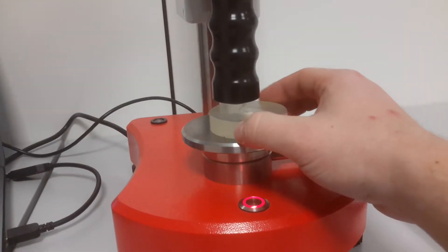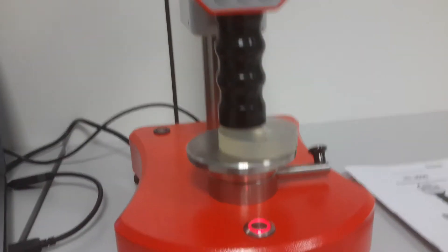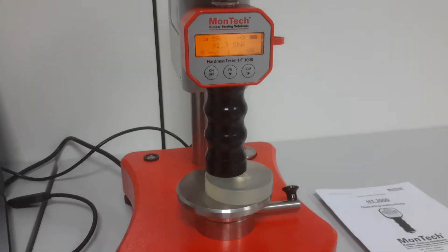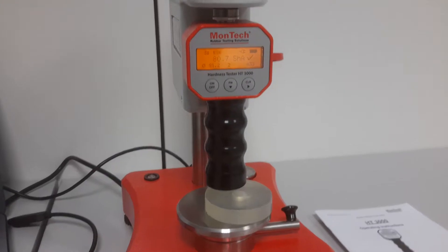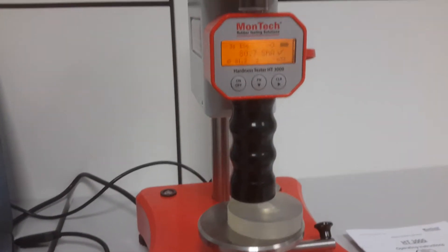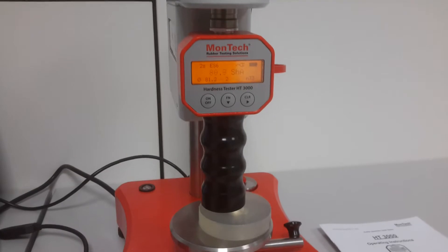The instrument is directly ready for the next test. Simply reposition the sample, hit the start button and read the results. A statistics as well as average display is shown automatically.